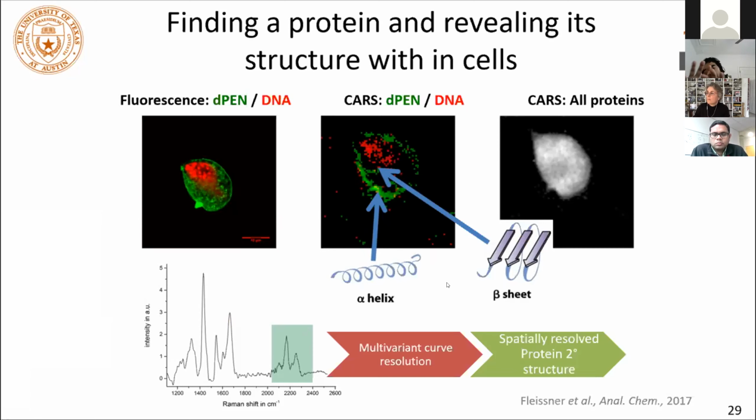And so now we separated those two and then did the decomposition on those. That's one way that we are able to minimize the bias in the two groups, by recognizing where they exist. In the case of Vimentin, we can't do that. We don't have as many spectral data points, so we just had to bin everything together. In that case, we do see what is most dominant, and we cannot see the heterogeneity.